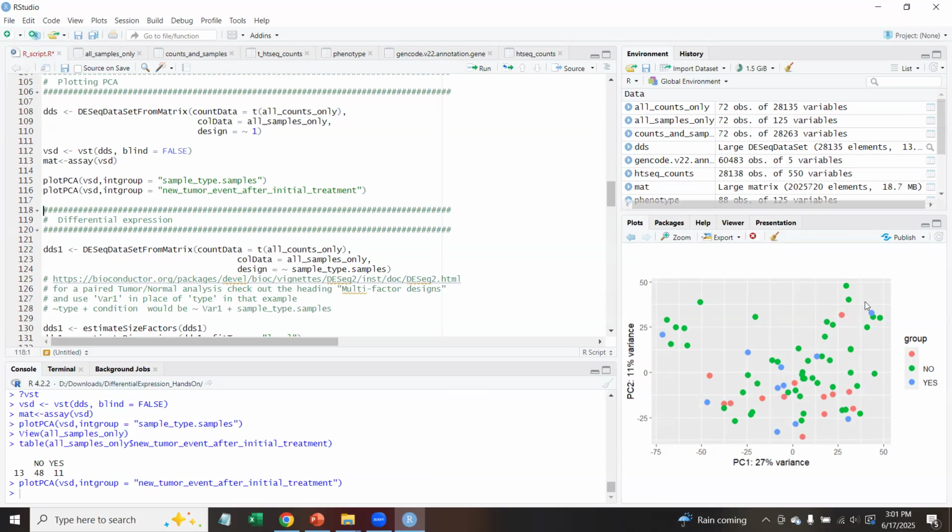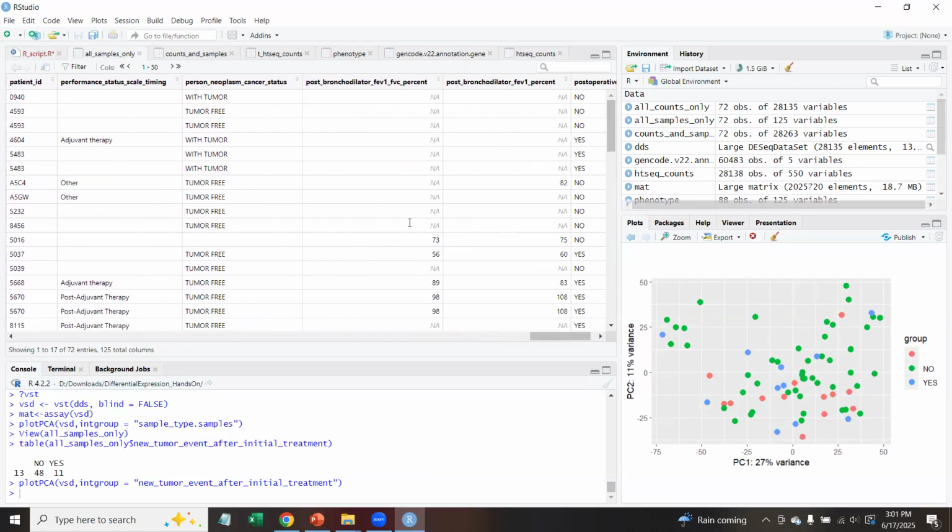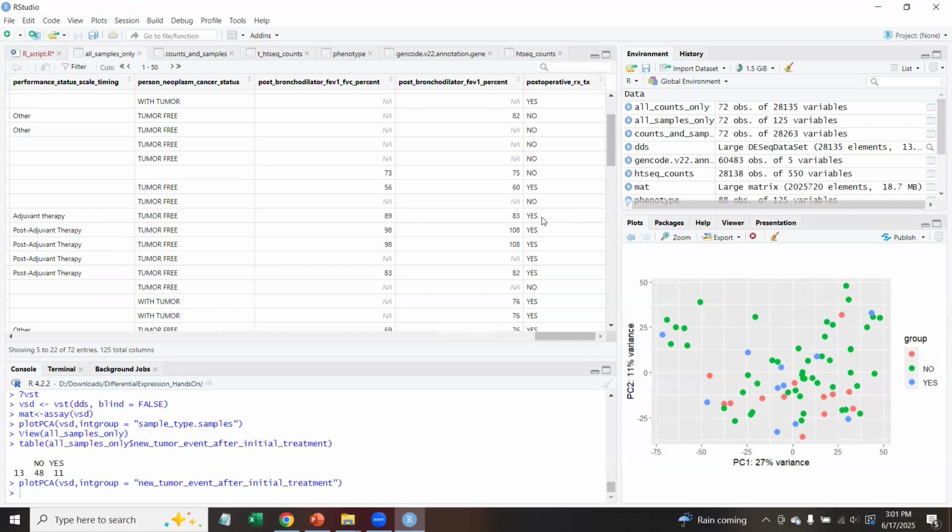So as you're thinking about your particular analysis for your differential expression, if you're pulling from TCGA, are you going to compare normal versus tumor, or are you going to compare something different? So something that might be interesting about the tumors.